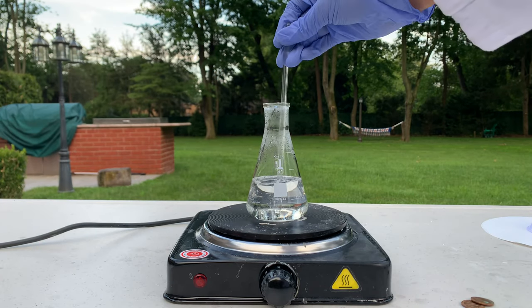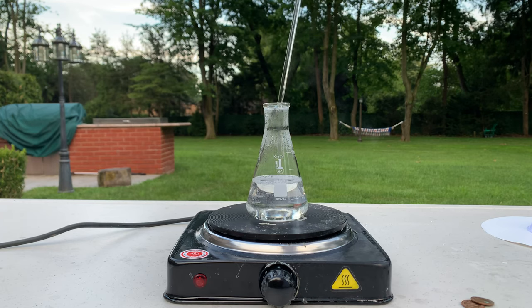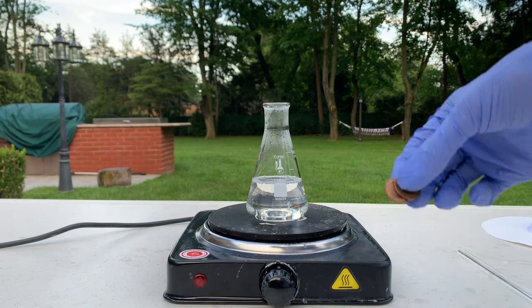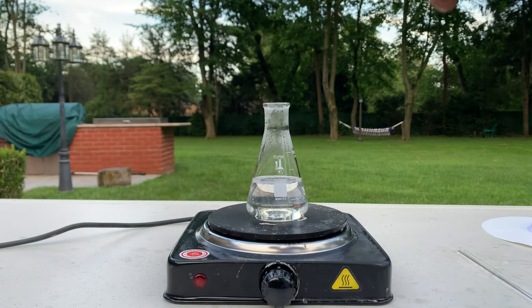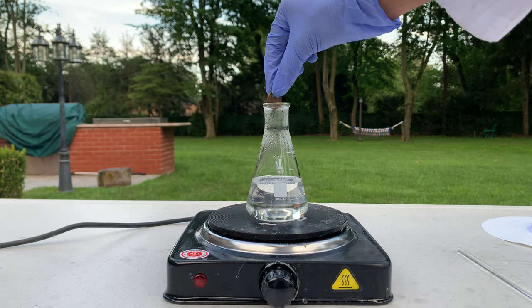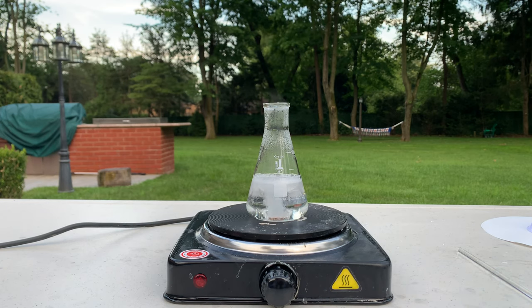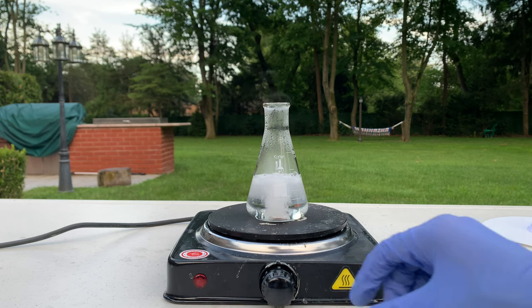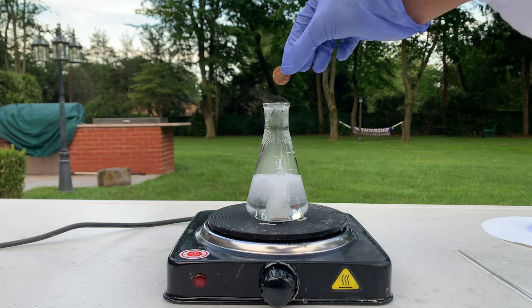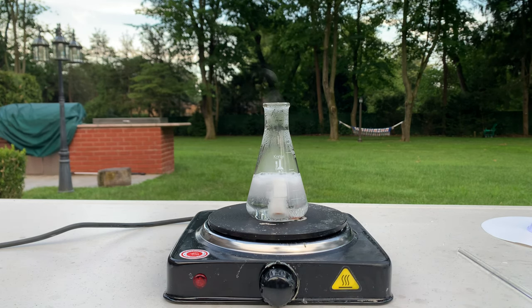I've been heating up the solution and it's almost at a boil — you can see some bubbles escaping. So I'm going to start adding the pennies now. I have two pennies: one is 1970 and one is 1975, so those should be good. I'm going to try not to make too big of a splash and just drop them in. Immediately you can see the solution starts bubbling — I'm going to turn down the heat a little. I'm going to add one more penny now. I didn't expect the reaction to go this fast.